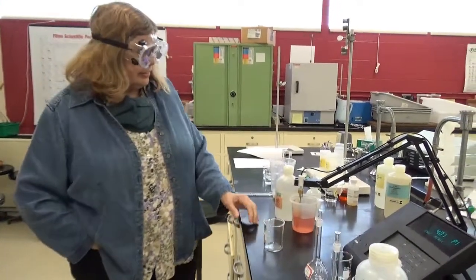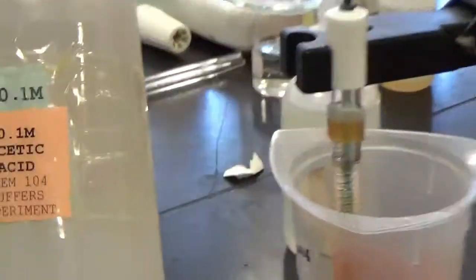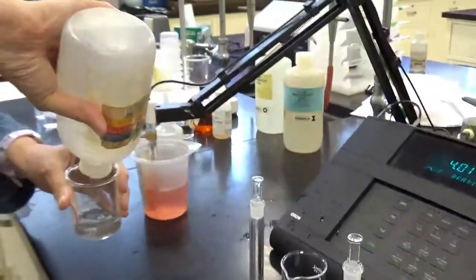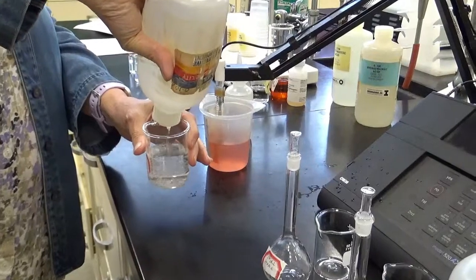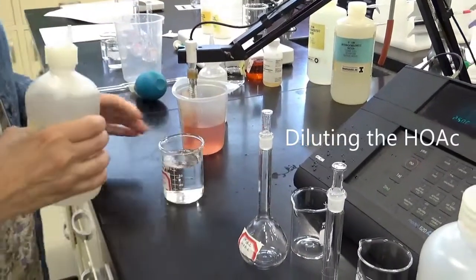All right. So now I'm going to do precisely the same thing, except with a weak acid, acetic acid, which we call HOAc. Oh, here it's labeled acetic acid. Okay, and it's 0.10 molar. So I'm going to put some in this flask. And then I'm going to do 2 dilutions again, the same type of dilutions.